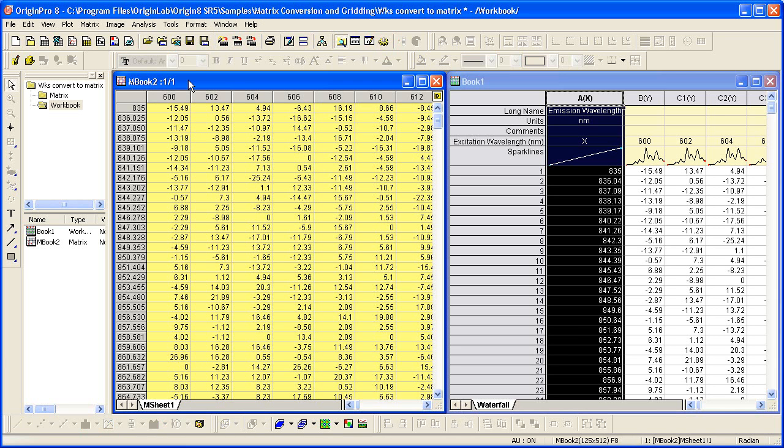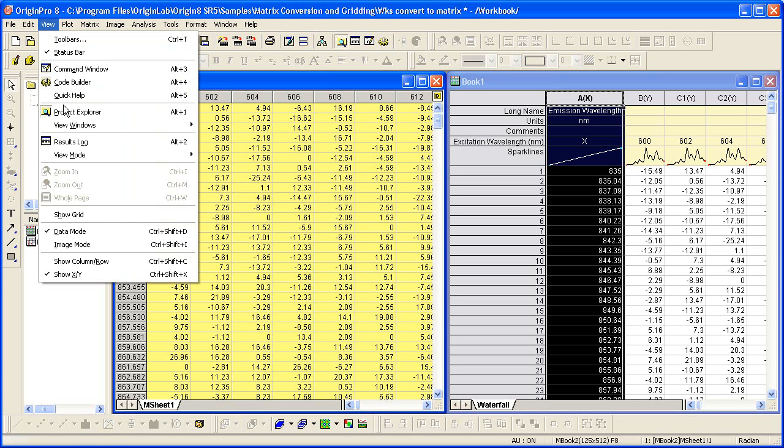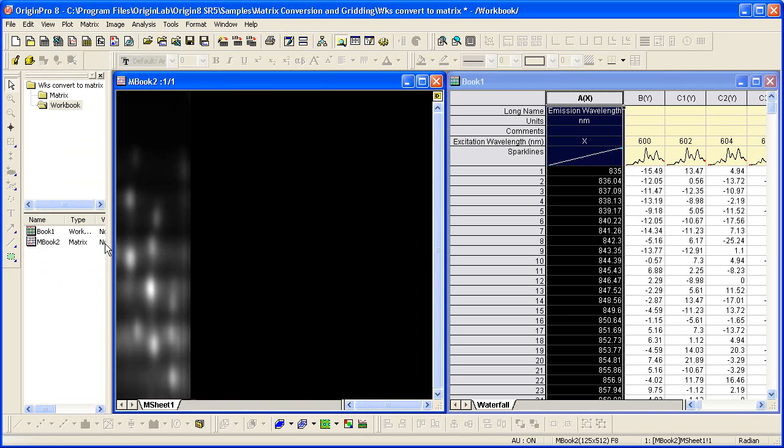Now matrices can be viewed as data or as images. I'll select view and change the mode to image mode. The dimensions of the matrix are such that there are more rows than columns, and this image mode displays maintaining the aspect ratio.